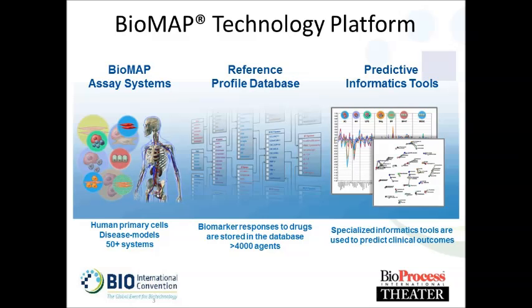So our technology platform is really built on three separate pillars. Again, we work almost exclusively with primary human cells. There are some exceptions in oncology where we may work with cell lines, but we built more than 50 different primary human cell systems. We build these into disease models using growth factors or cytokines to model a disease environment, and then look at how drugs change biomarker responses in these systems.